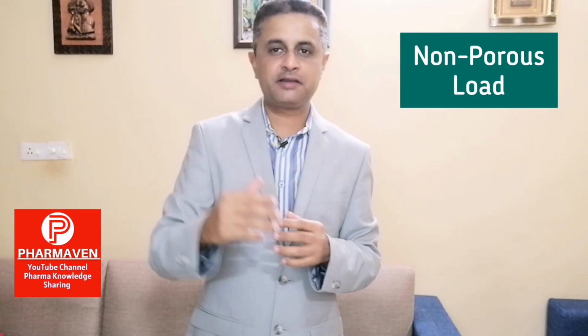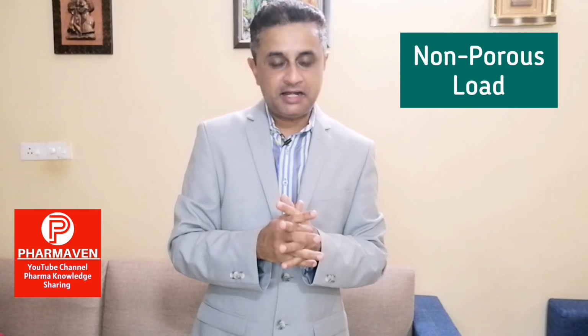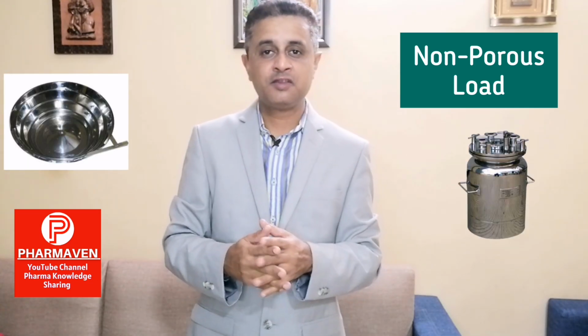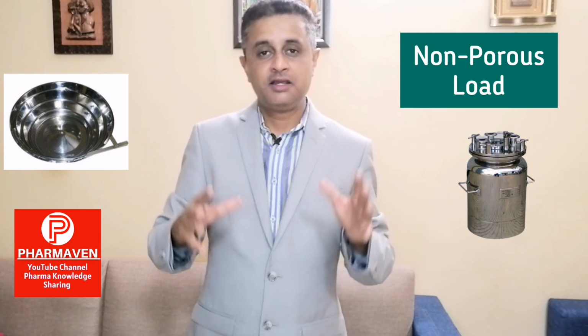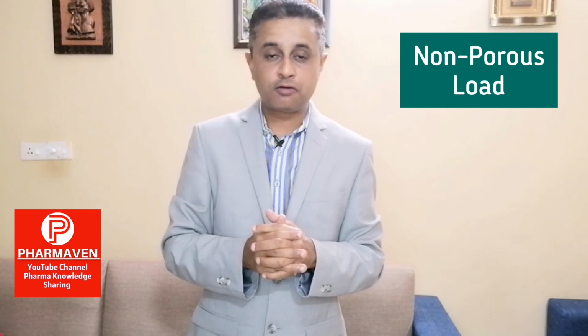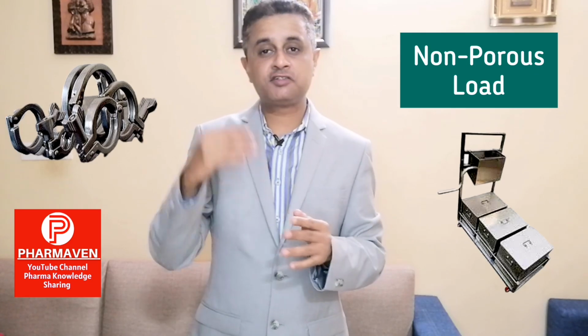If such loads are kept inside the autoclave, then this becomes a non-porous load. I repeat again. Load items such as SS vessels, SS filling assembly connected to the tubings, glass bottles, or our sanitization load where we have the triple bucket system, fall under the category of non-porous load.